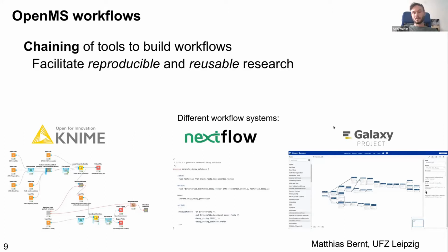And yeah, another thing I want to mention is the Galaxy project. There you have everything in your browser, and all the OpenMS environment is already set up for you. So if you just want to take a look and play around with it, it's perfect. You can go on the Galaxy Europe server and upload your data there and then access all the algorithms. One of the downsides might be if you have slow internet connection, it's not very good, or if you have sensitive data that you don't want to share on the internet or just don't want to upload.